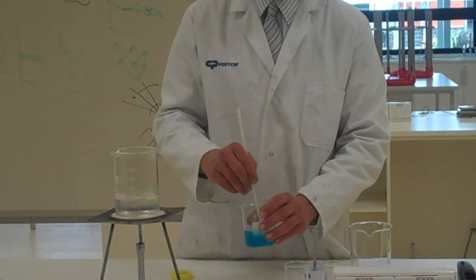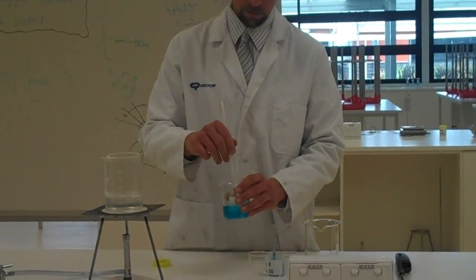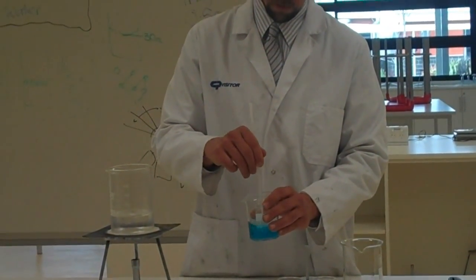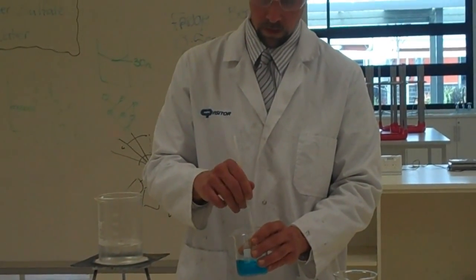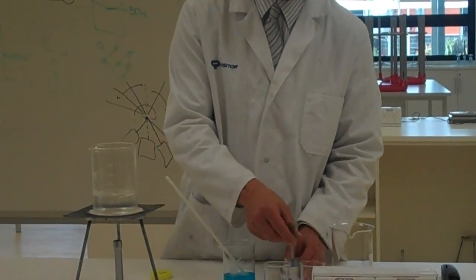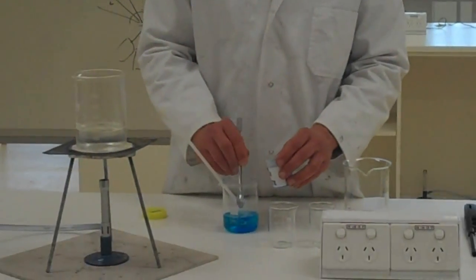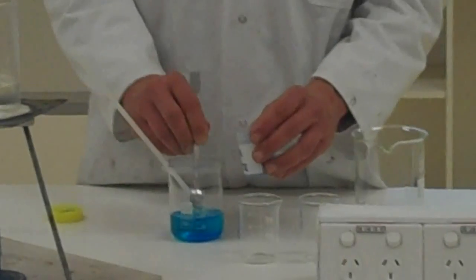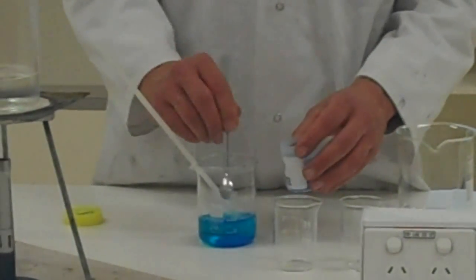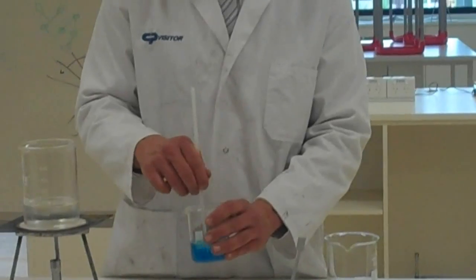I'll just dissolve this in the meantime. That's all dissolved, so I'll add some more. I'm trying to make a saturated solution — when no more will dissolve, that's when I know I've had enough. All the time I'm stirring.